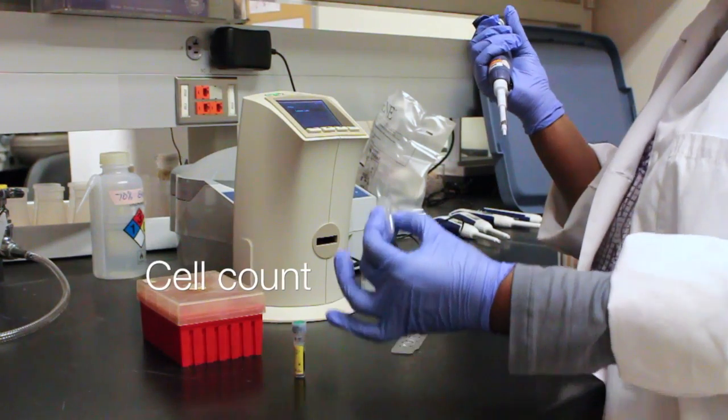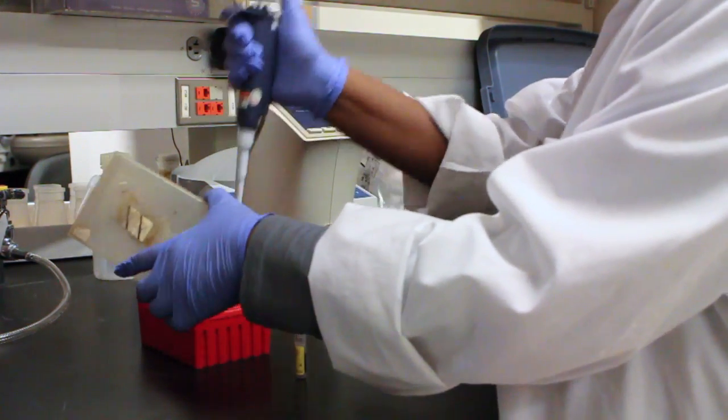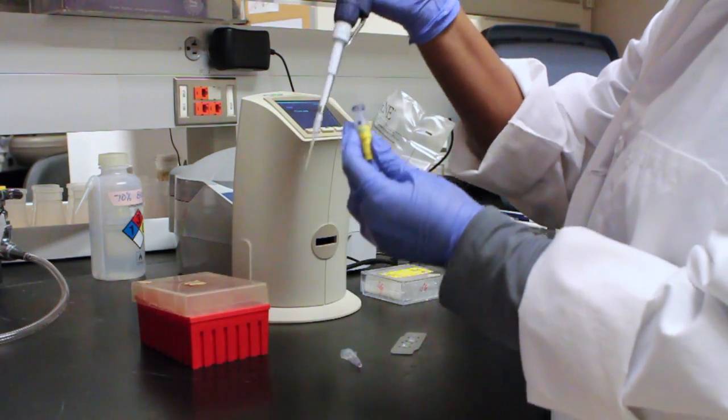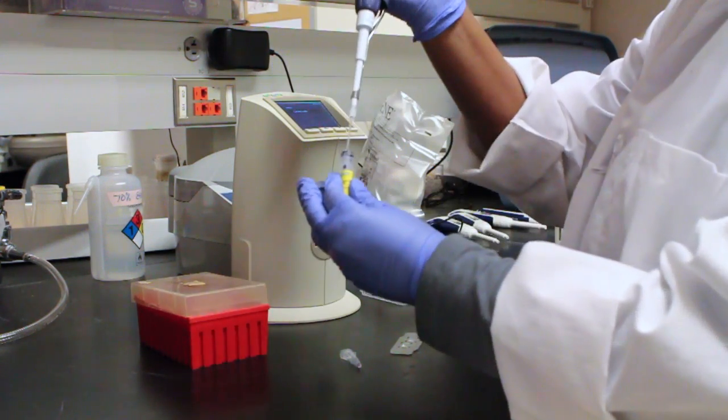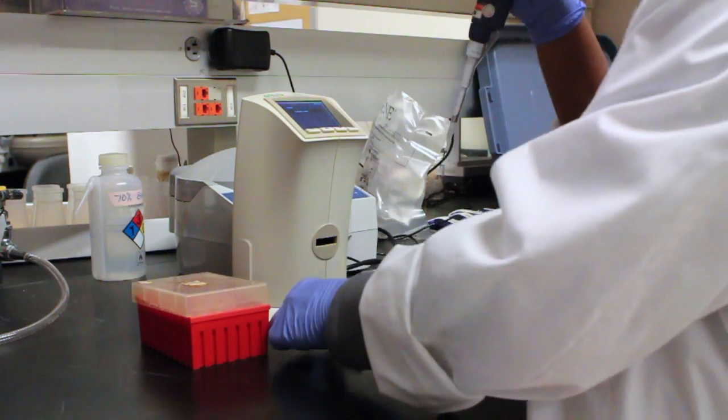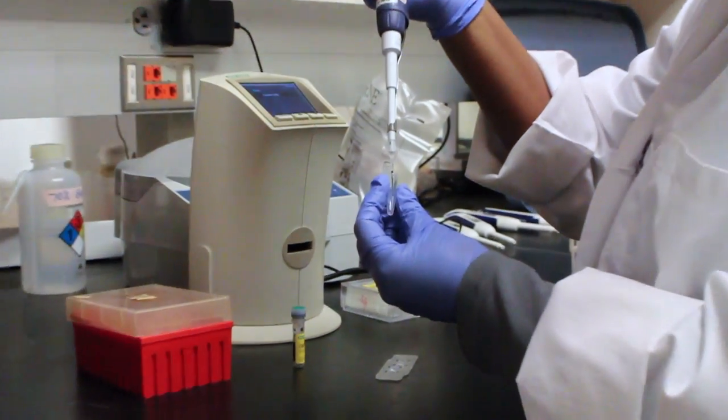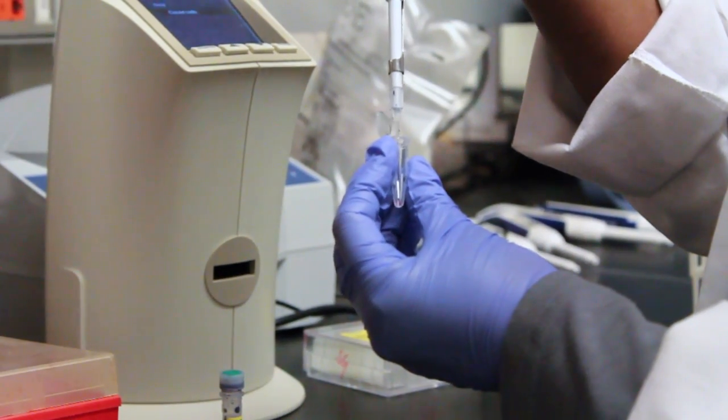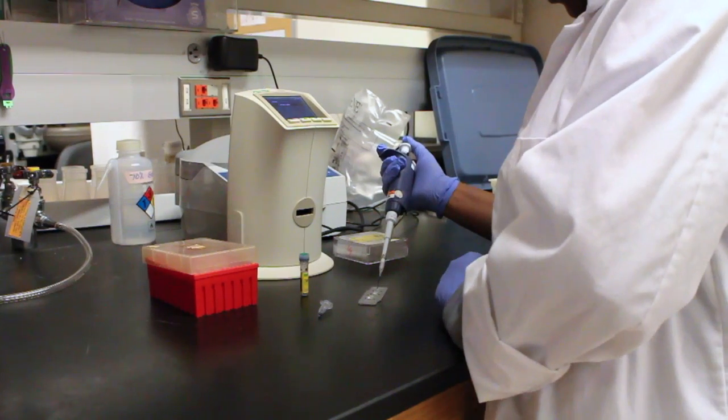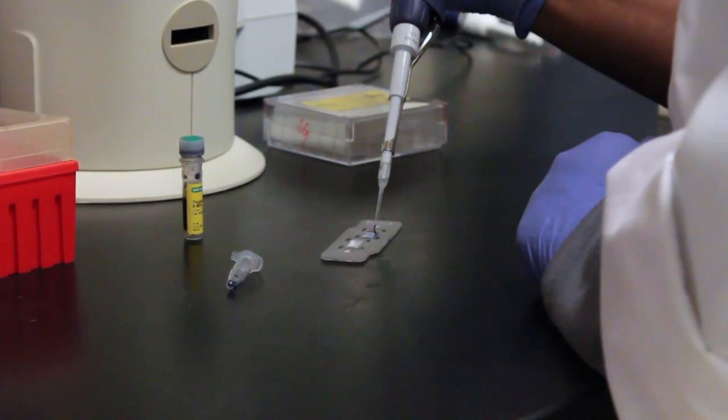Proceed over to the cell counter. Using a new pipette tip, remove 10 microliters of trypan blue and place it into the MC15 that contained your cell sample for a total volume of 20 microliters. Triturate the sample 10 times and remove 10 microliters. Place into the cell counting slide and insert into the cell counting machine.